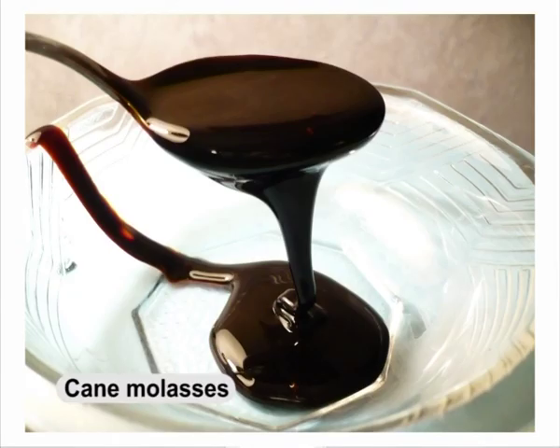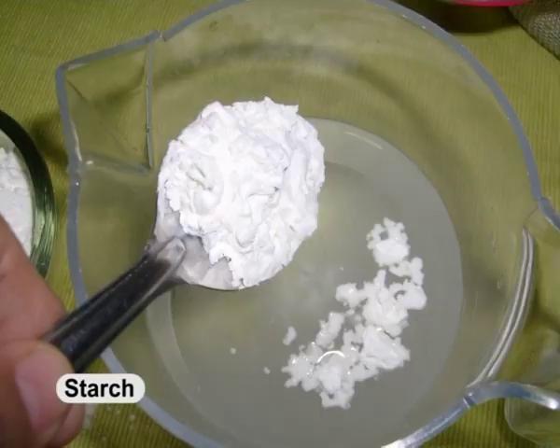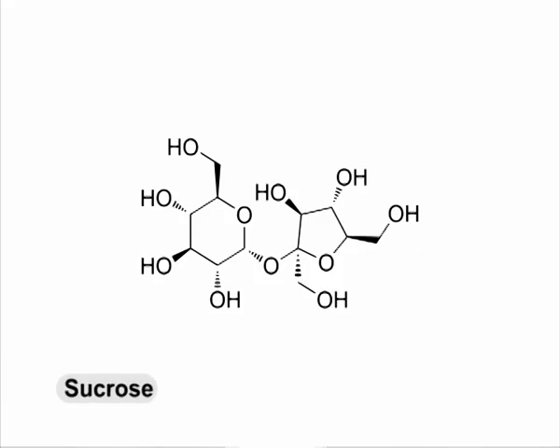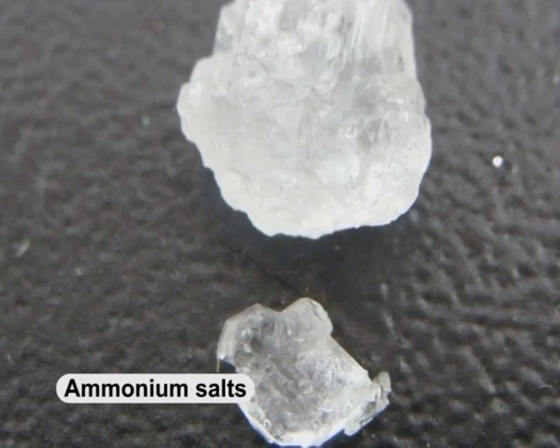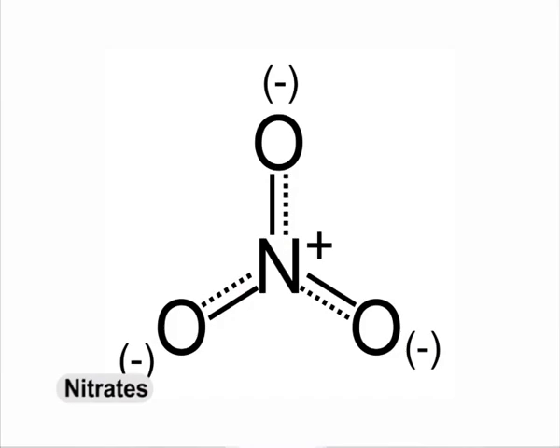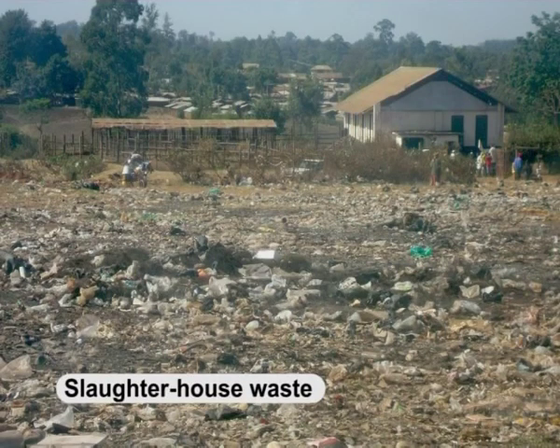However, the use of cane molasses, beet molasses, cereal grains, starch, glucose, sucrose and lactose as carbon sources, and ammonium salts, urea, nitrates, corn steep liquor, soybean meal, slaughterhouse waste and fermentation residues as nitrogen sources have tended to meet most of the above criteria for production media because they are cheap substrates.